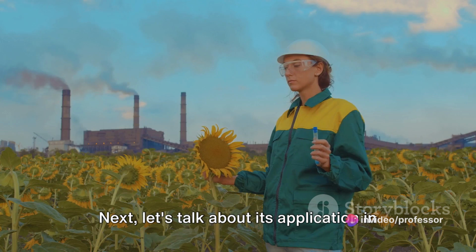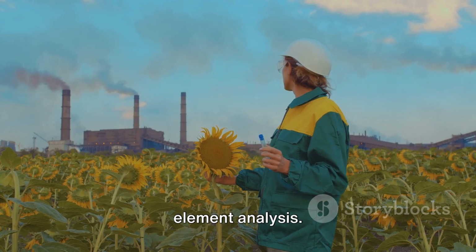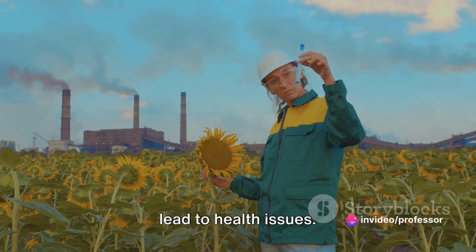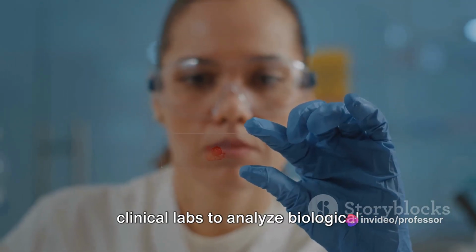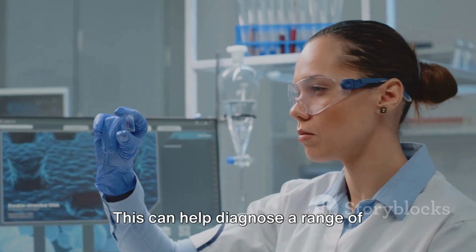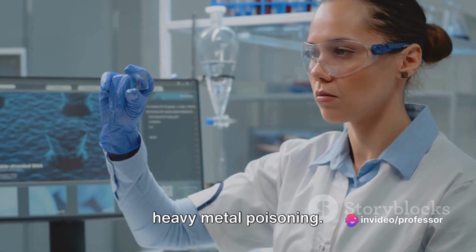Next, let's talk about its application in the medical field, specifically in trace element analysis. Our bodies require a delicate balance of various elements, and any imbalance can lead to health issues. Atomic emission spectroscopy is used in clinical labs to analyze biological samples, such as blood or urine, for the presence of these trace elements. This can help diagnose a range of conditions, from mineral deficiencies to heavy metal poisoning.